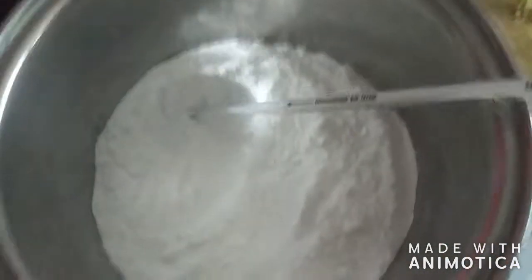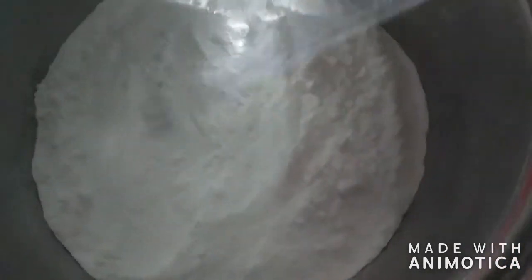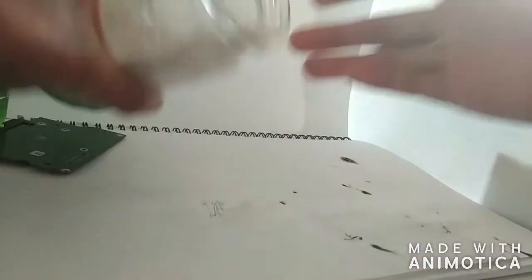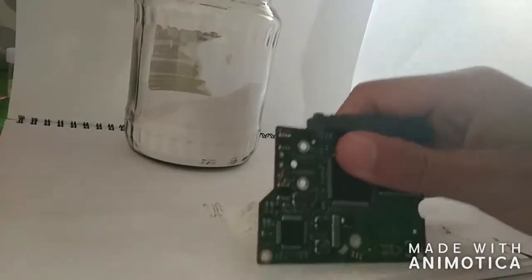Today we're going to be trying to make sodium carbonate from sodium bicarbonate. This process is by thermal decomposition, which uses heat as the name implies. All you need to do is put it on a stove and heat it up to about 300 degrees Celsius, and you should see bubbles of carbon dioxide gas escaping the solid.